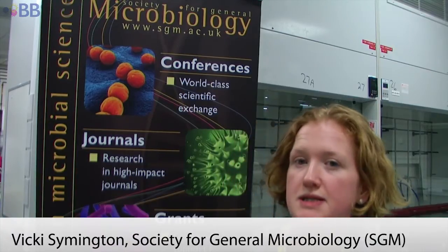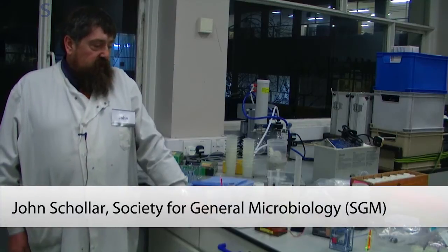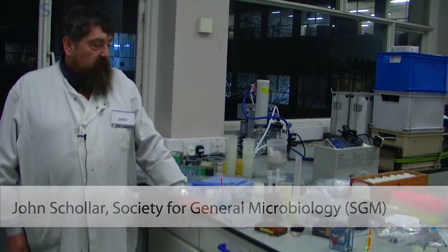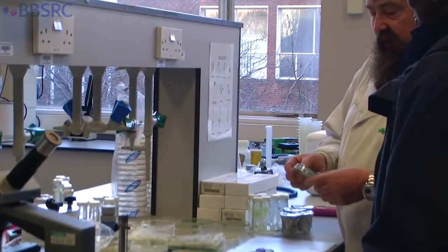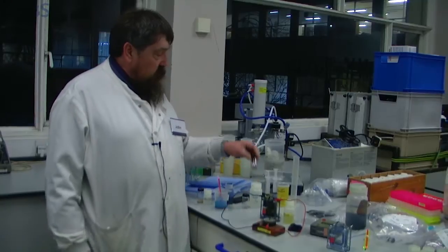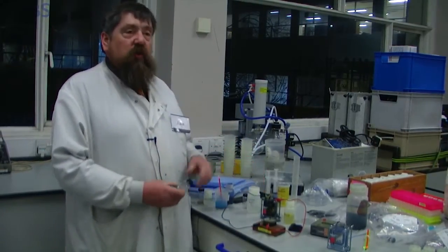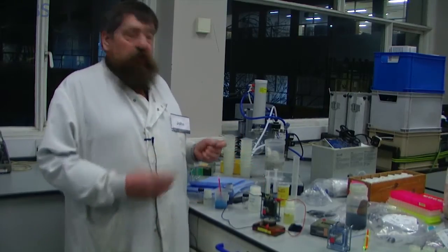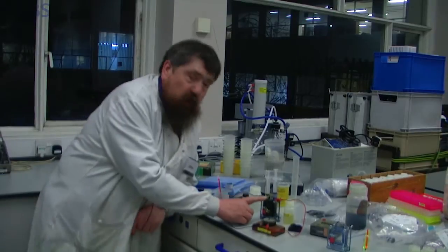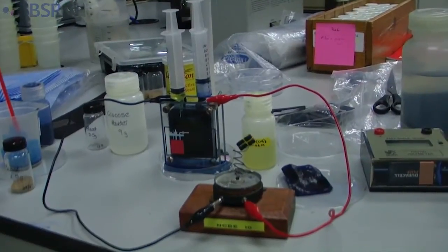I am here at the ASC in Liverpool to promote microbiology in all its senses. This afternoon we've been looking at four different practicals with visiting teachers. The first one looks at a microbial fuel cell — we feed some yeast sugar and then harvest energy from that, and by using this little microbial fuel cell we can actually produce a small amount of electric current.